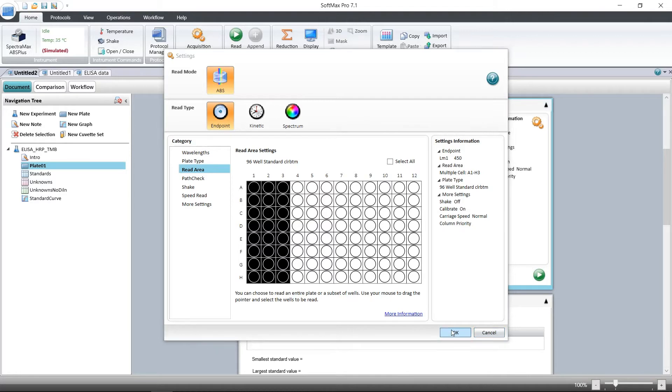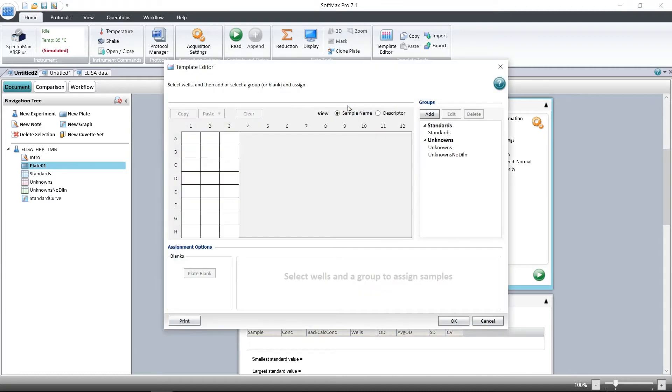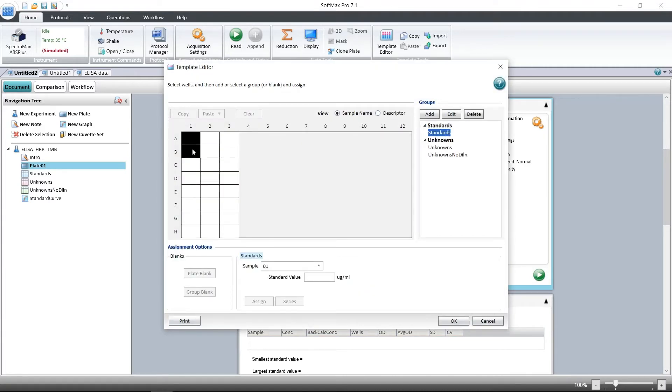You can also set up the template where we'll assign what kind of samples are in the different wells. Here we can select which wells contain standards, enter the concentration for each one, and then click assign.